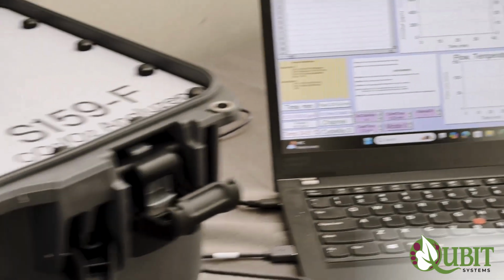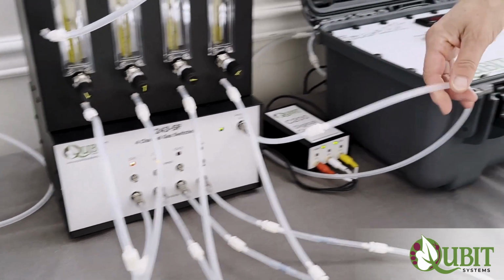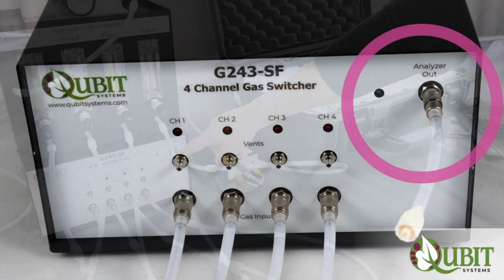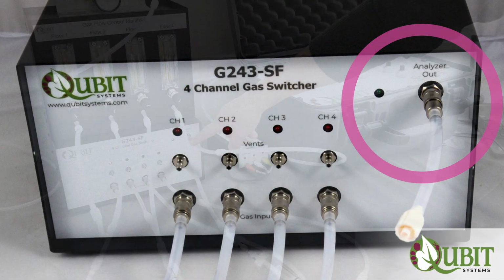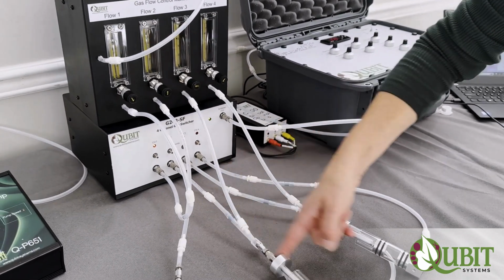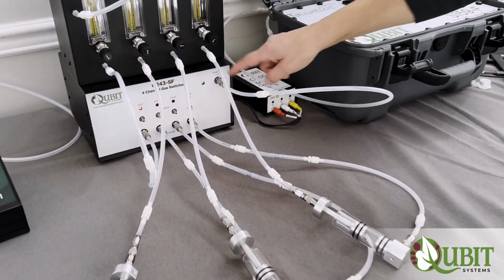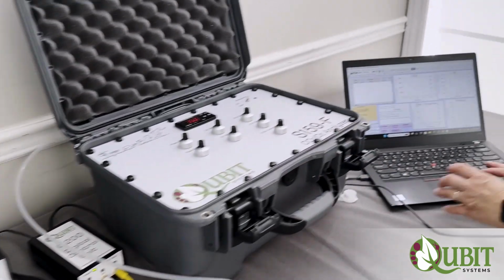But what happens is only the channel that's selected is being delivered to the analyzer through this analyzer out port. All the other channels will be venting at all times. So there's always flow through each chamber, but the flow is venting, and only selected channel is delivered to analyzers.